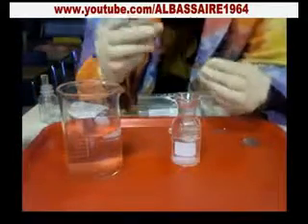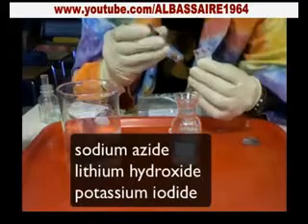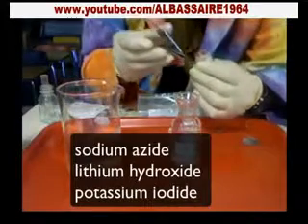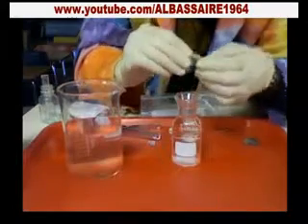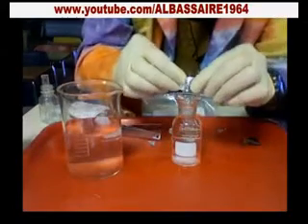Now I'm going to put my dissolved oxygen 2 packet in. This is actually 3 chemicals: sodium azide, lithium hydroxide, and potassium iodide. So let me add that, and now I'm going to mix it up.